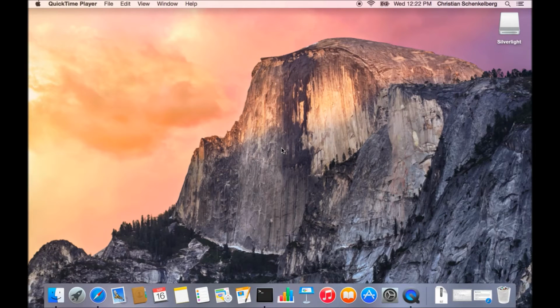Hello everyone, in this video I will be demonstrating how to install InteractiveROSETTA on a Mac OS X system. The machine I will be installing InteractiveROSETTA on is a Yosemite system.